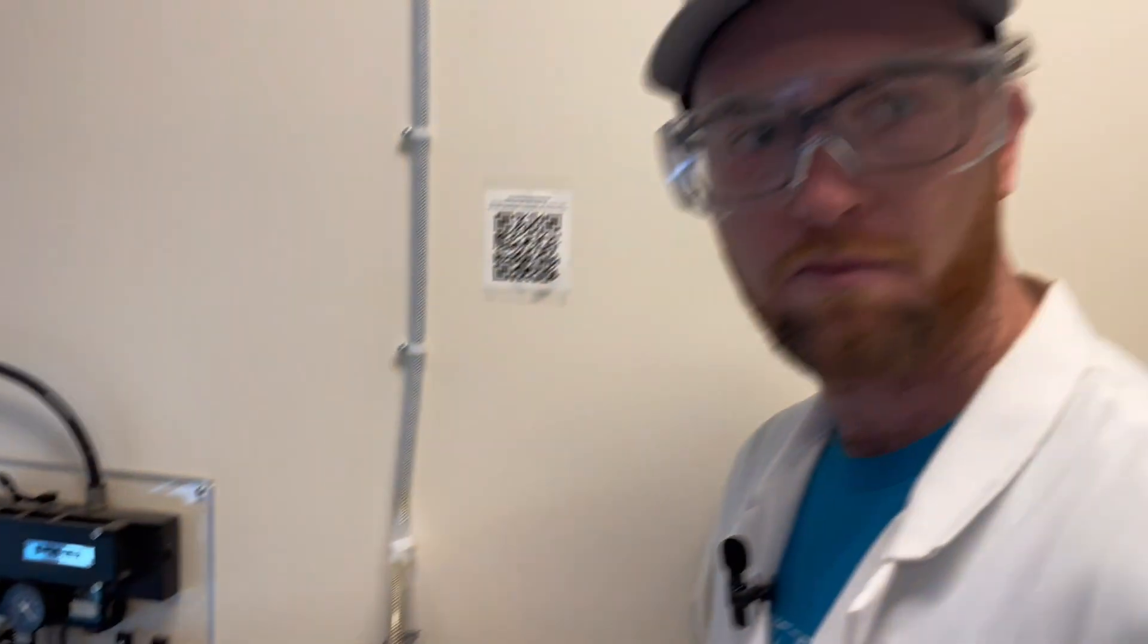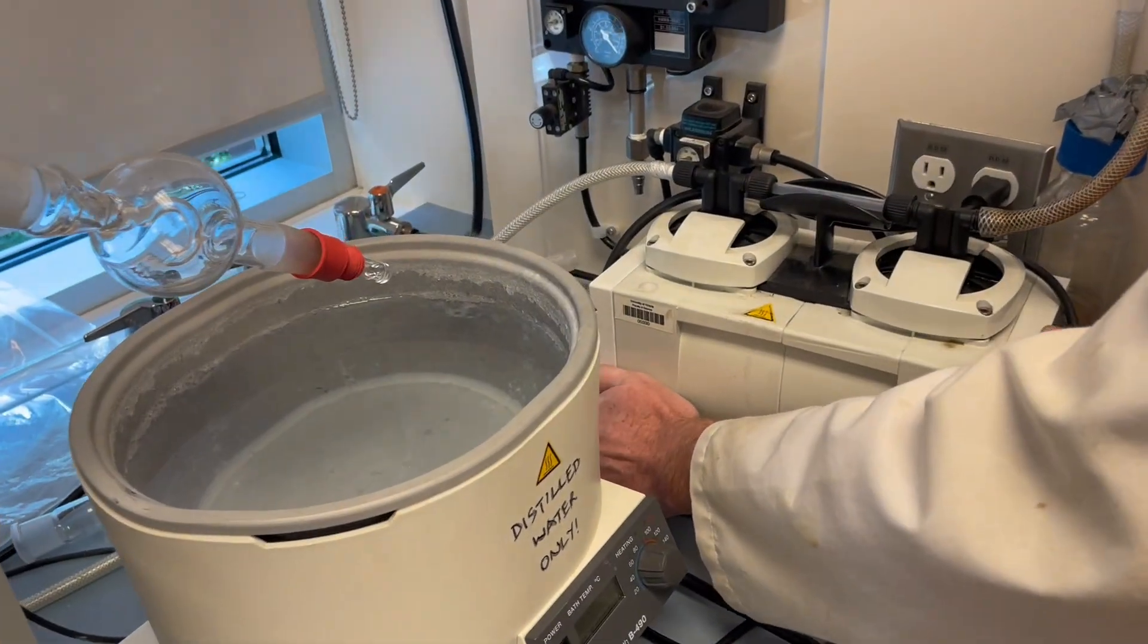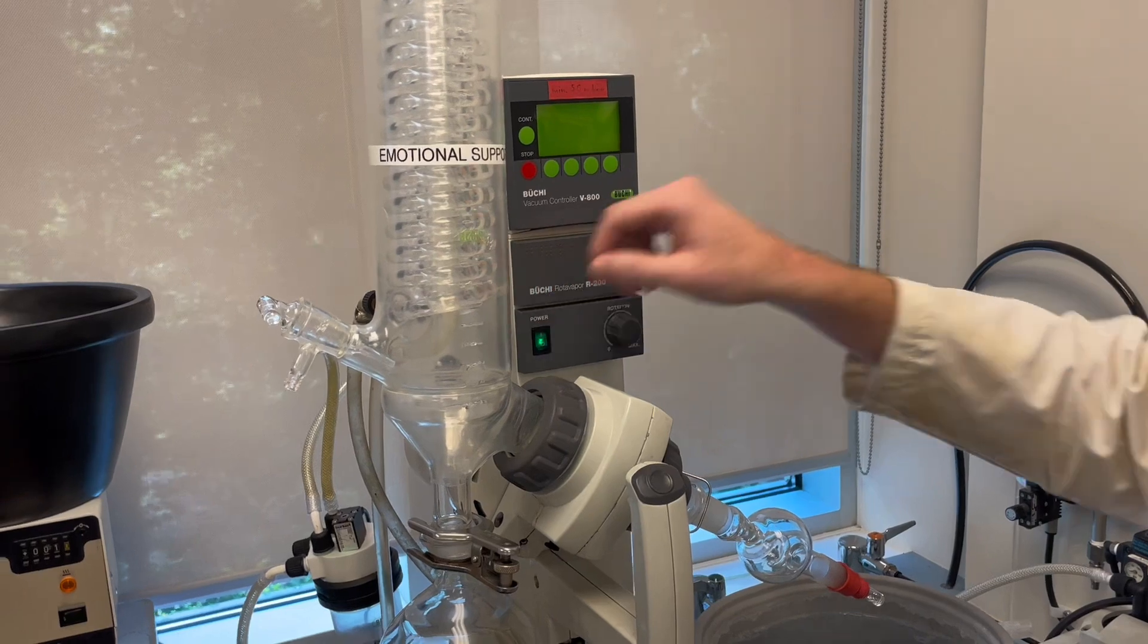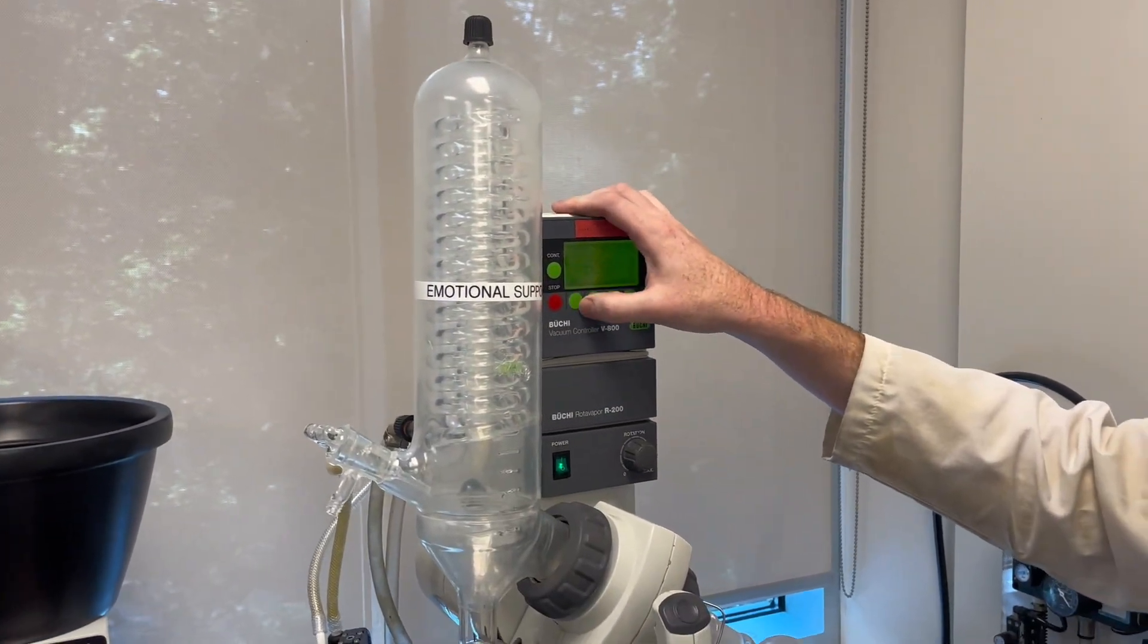Now to begin the rotary evaporation process, turn on the vacuum pump, turn on the rotary evaporator, ensure that we're closed to the atmosphere, and hit run.